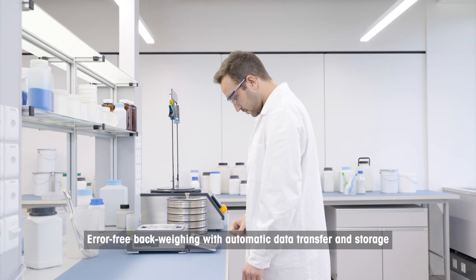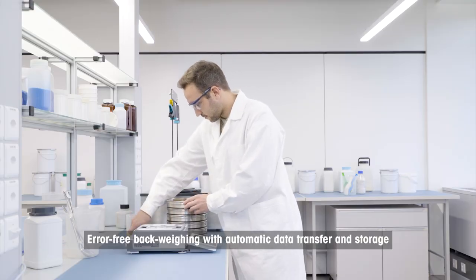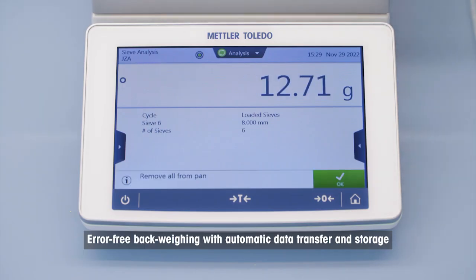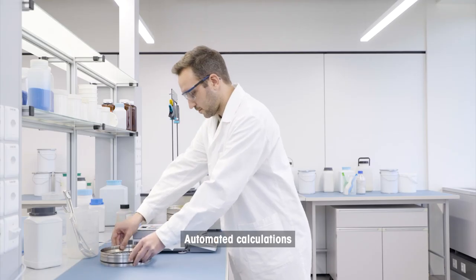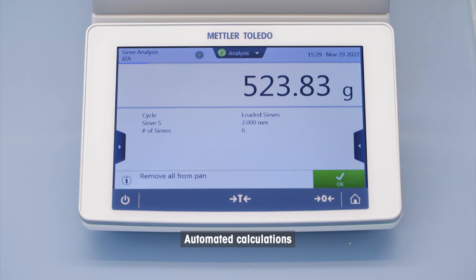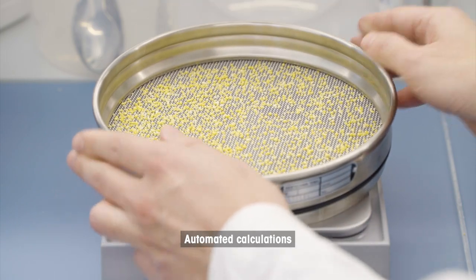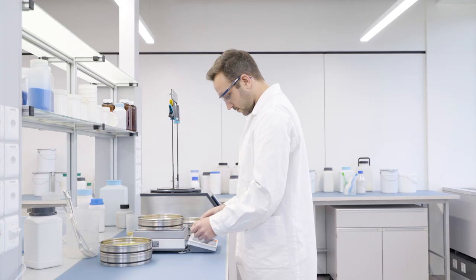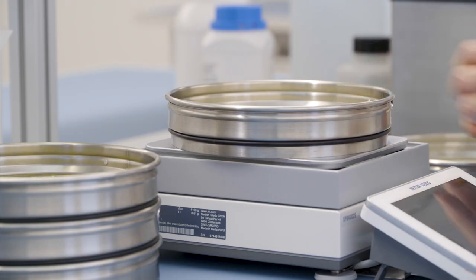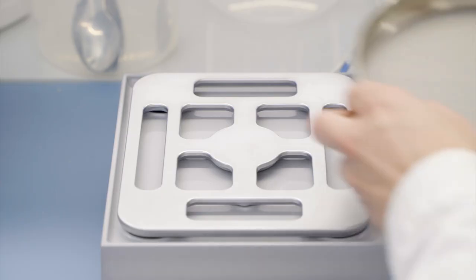Sieves with their respective particle fractions are backweighed in reverse order on the balance. Results are automatically captured, transferred, and stored. An audio signal prompts for the next sieve. For each sieve, fractional weights are calculated automatically, and the distribution percentage is displayed on the balance screen.